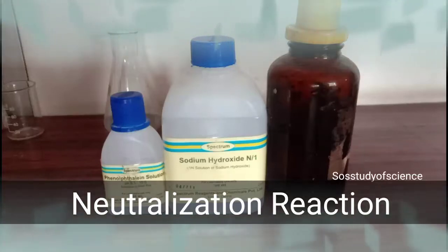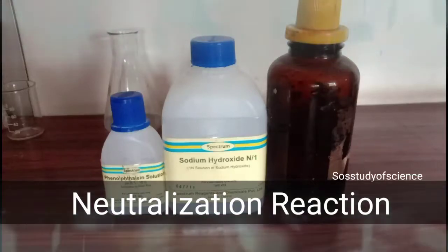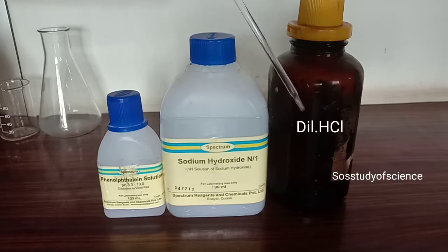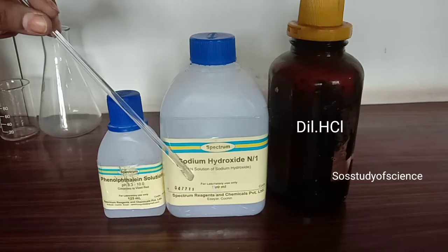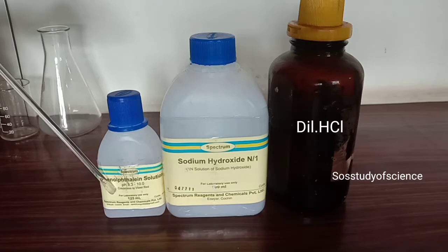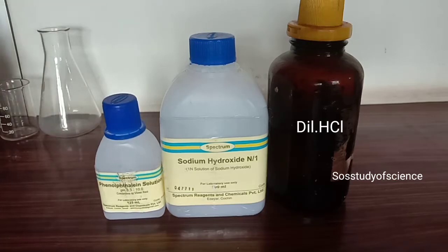Let us perform an activity to know about neutralization reaction. To perform this, we need dilute hydrochloric acid, sodium hydroxide solution, and phenolphthalein solution.